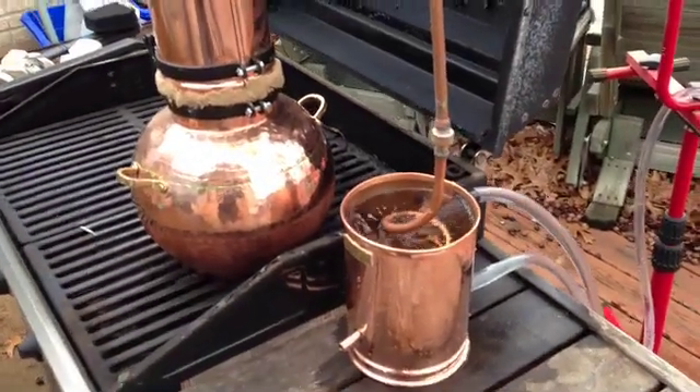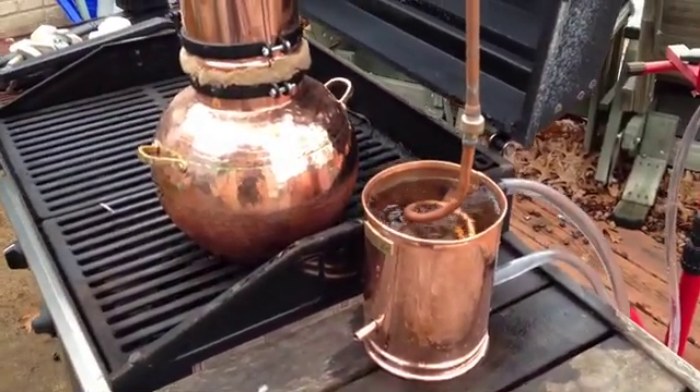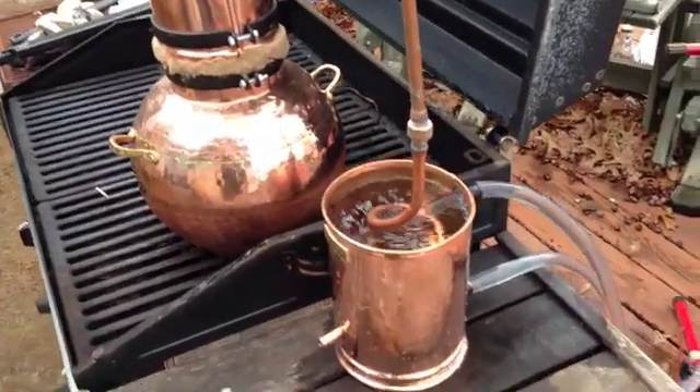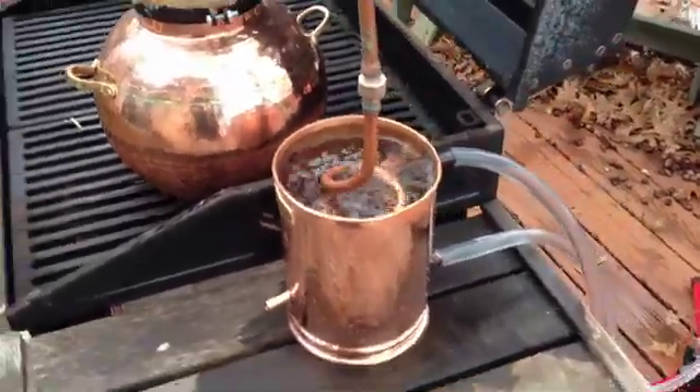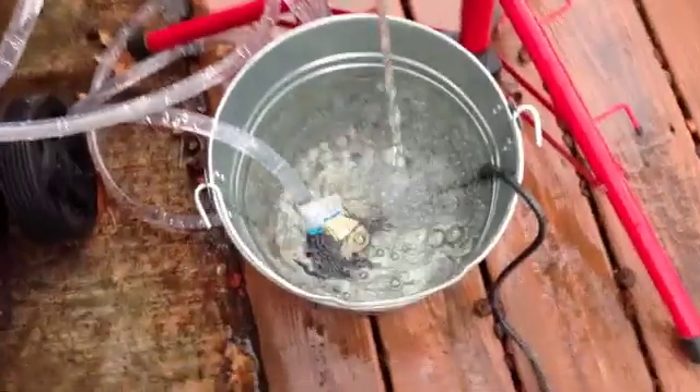Over here is the condenser part, which we don't have anything coming out of it yet because we're not boiling the water quite yet. The condenser is fed by a water pump down at the bottom of that.